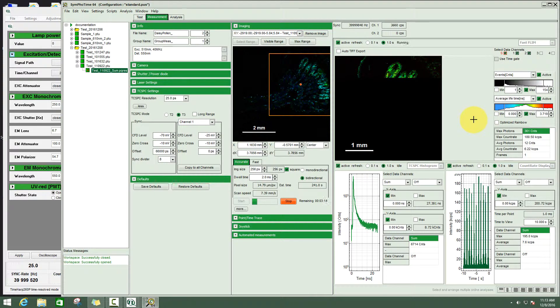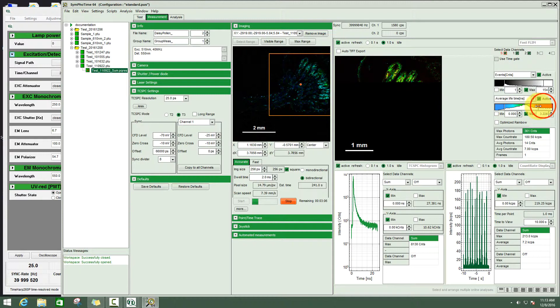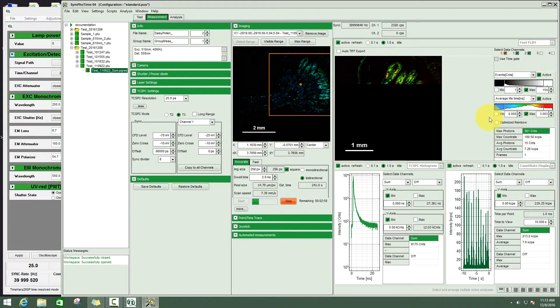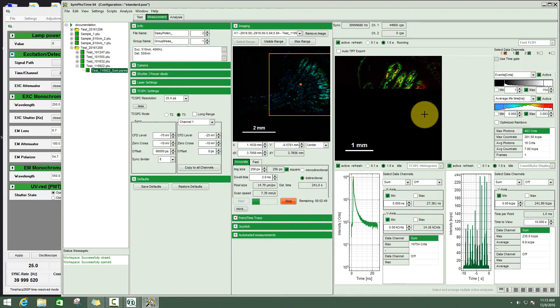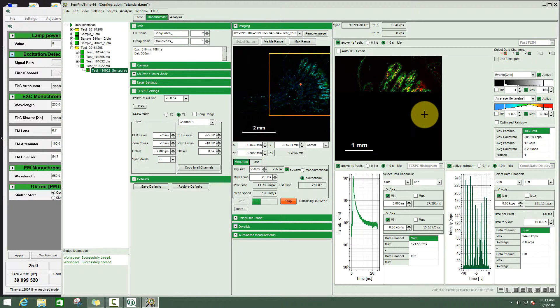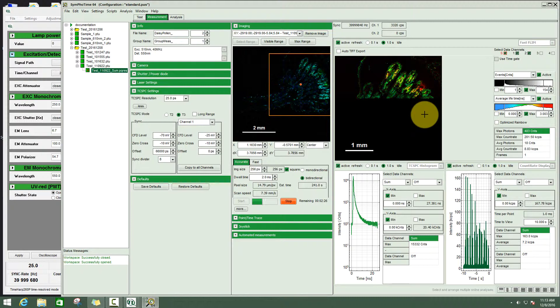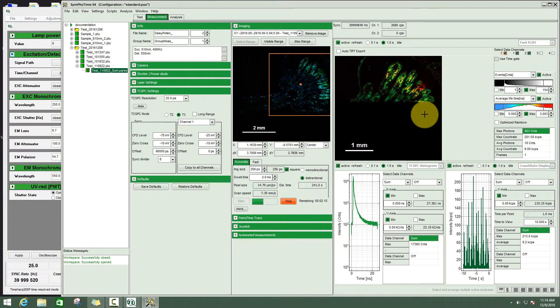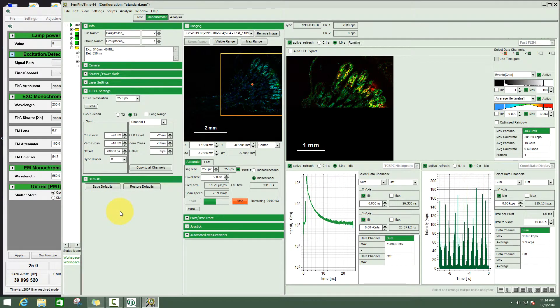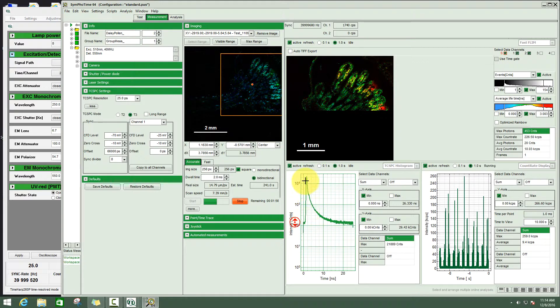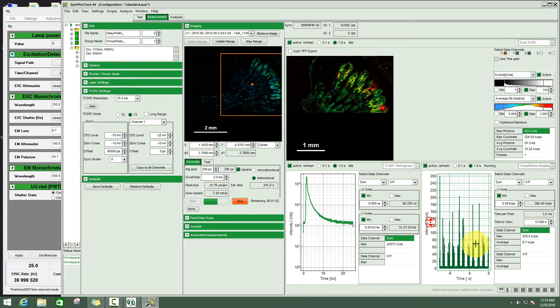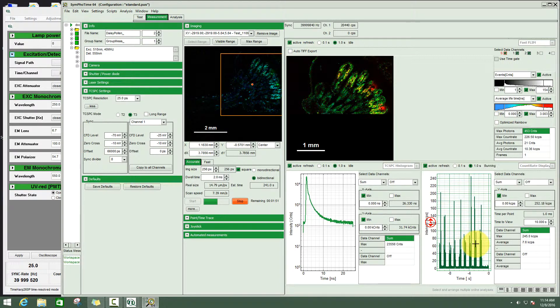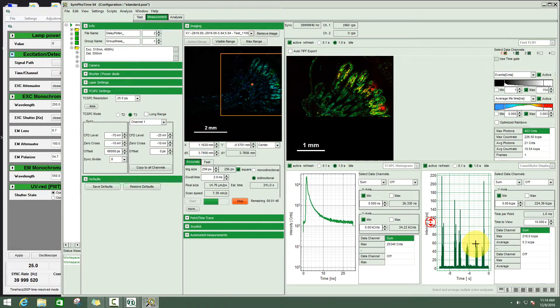We can already see beautifully the pollen here. You can see that in the image there are some lifetime contrasts if I adapt the color scale correspondingly. This color scale shows the mean arrival time of the photons which we call fast FLIM calculations. It's not a real fitting but just a preview that gives some idea about the lifetime contrasts.